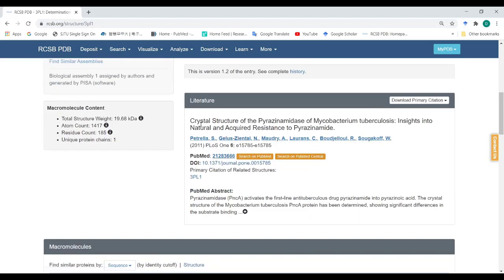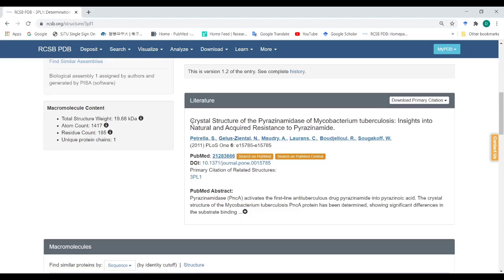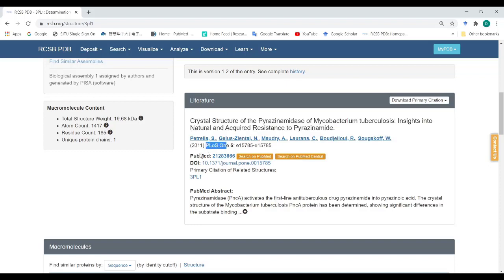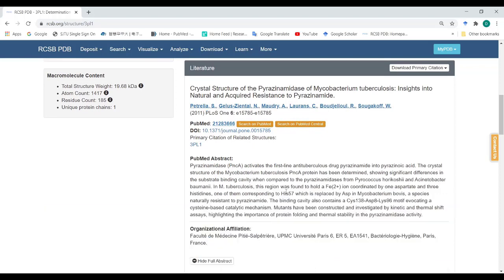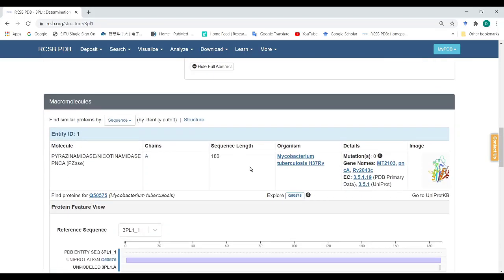This is the literature for this protein — this is the title of the manuscript in which this protein is published. It was published in PLOS ONE in 2011. If you want to read the details of the structure, this is the PubMed ID of the manuscript, which you can use to download it, and this is the DOI of the manuscript.